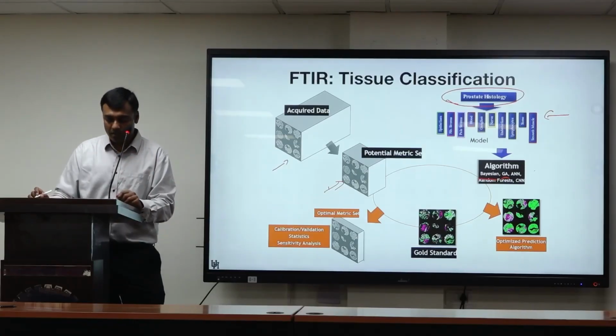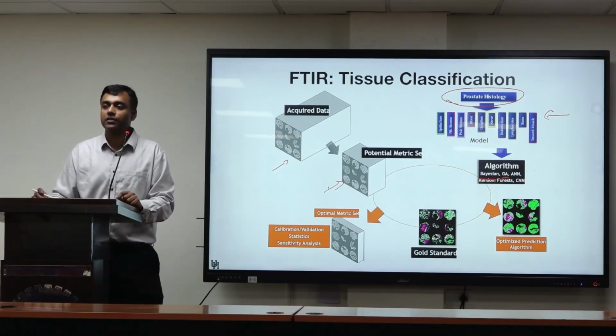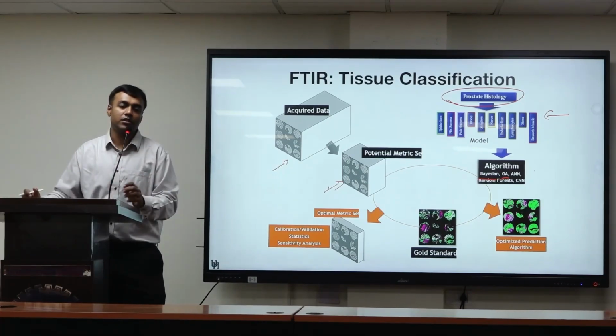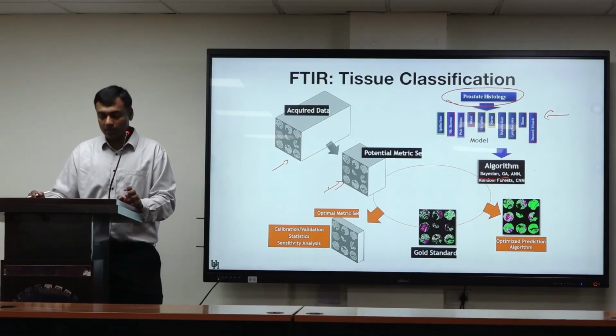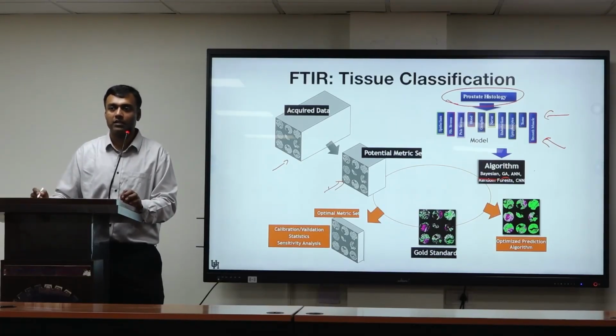After optimization, we get analysis and results where it turns out that for breast cancer and prostate cancer, which were some of the things we worked on, and this work has been continued in my previous lab, they have extended this to more than a thousand prostate cancer and a thousand breast cancer patients. So it has been validated quite extensively, and you get about 99% accuracy for tissue subtyping. For prostate cancer, that means identifying 10 different cell subtypes.